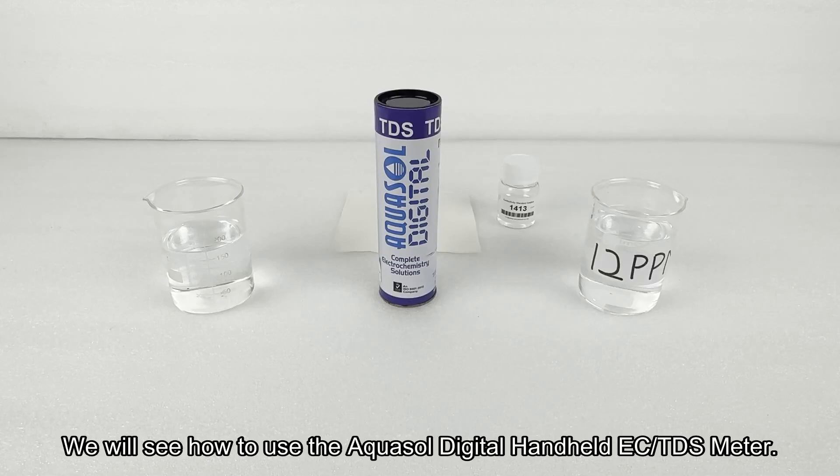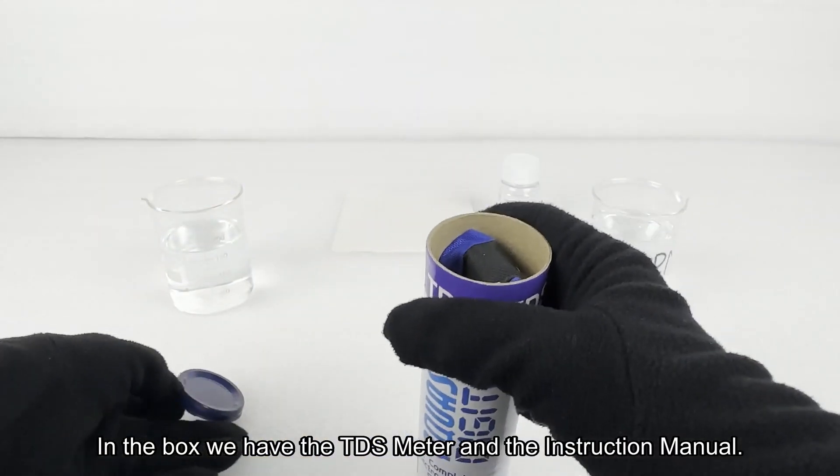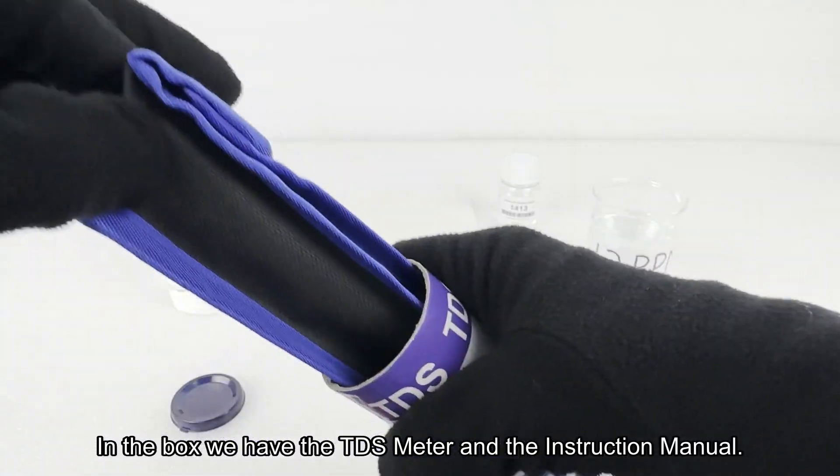We will see how to use the Aquasol Digital Handheld EC TDS Meter. In the box we have the TDS Meter and the instruction manual.